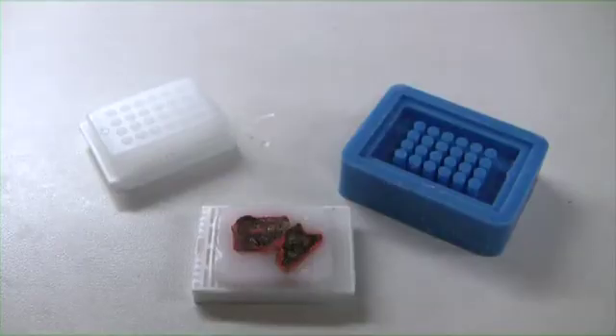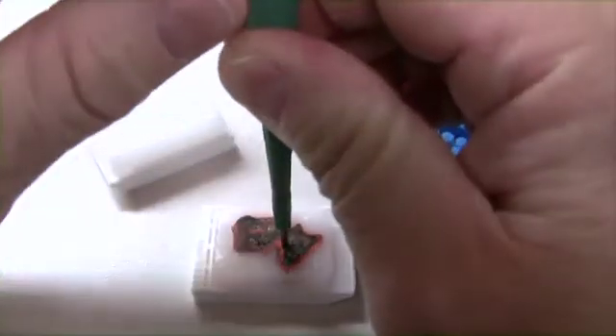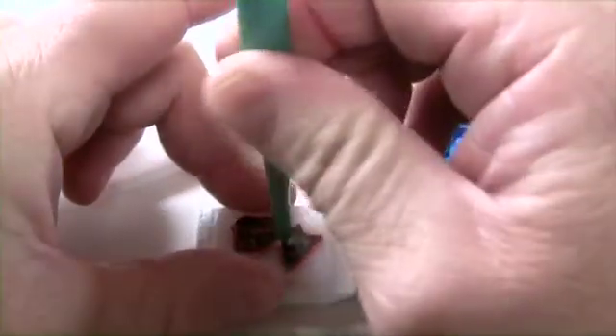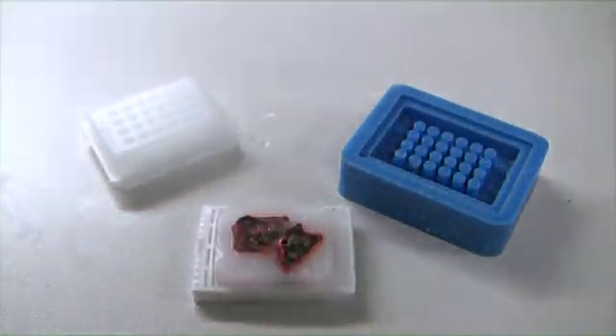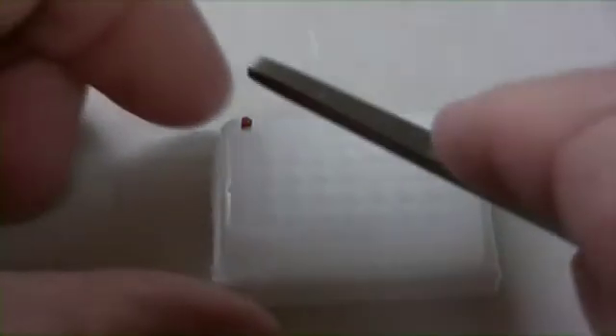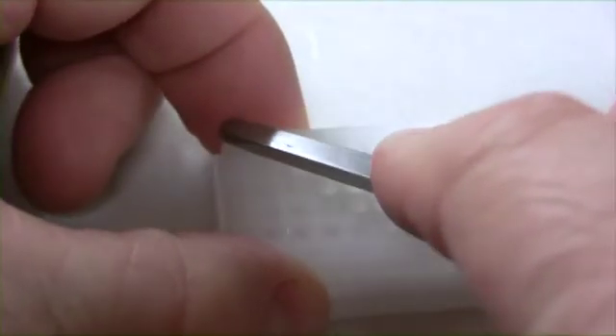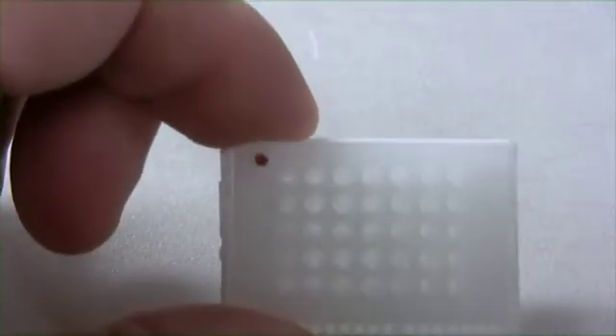I keep my TMA blocks at room temperature or slightly warmer when I'm constructing them. Use the 1.5 millimeter needle to punch your location marker. As you can see, the core is a little snug. Use the backside of a pair of forceps to push the core into the hole. That's a good block. Now I can start my TMA.